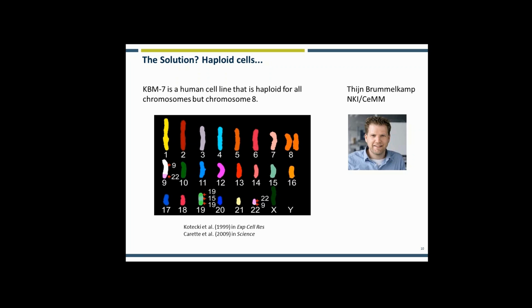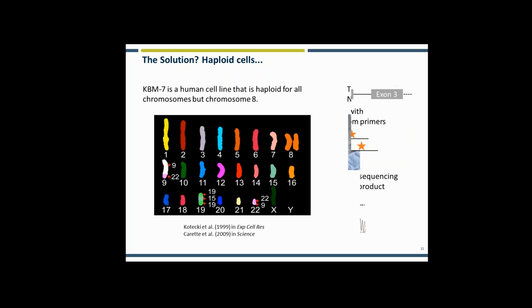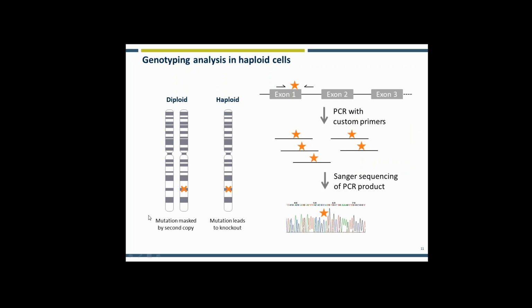And he used this very effectively to determine pathogen host factors. But the same strength, this fact that you only have a single copy of each gene and therefore you can very efficiently knock out genes in this cell line, also lends itself to doing CRISPR genome editing. Not only can you more efficiently target in that cell line, so for example you only have to modify a single copy rather than multiple copies, but it also releases this validation bottleneck, as you can straight away sequence from the genomic DNA and ascertain the nature of the modification in your particular clone.